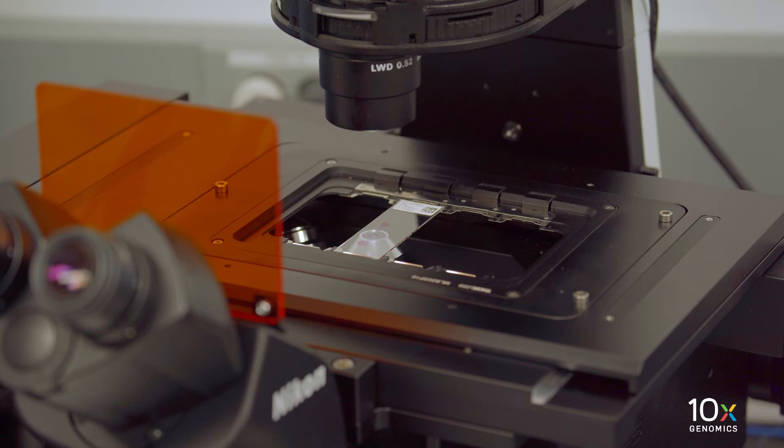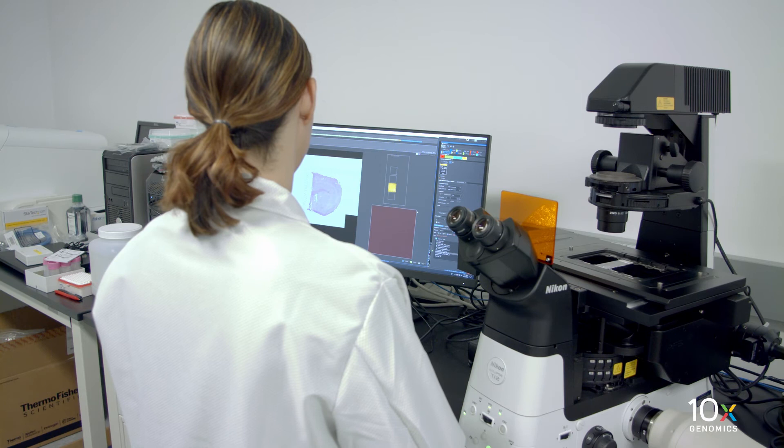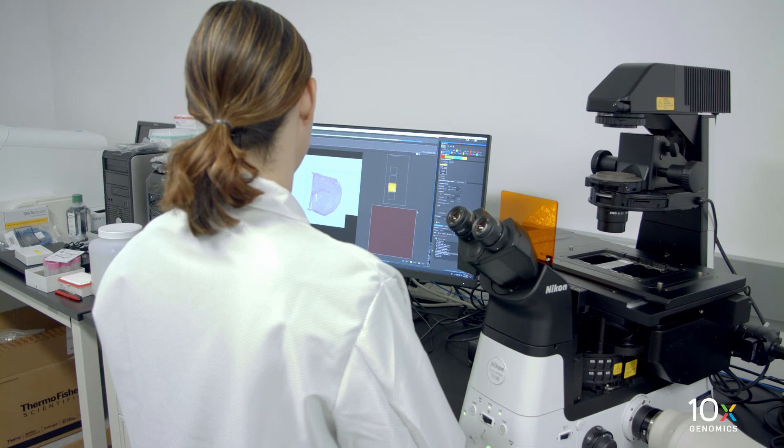Hit play to begin imaging. We will image all four capture areas individually at the desired magnification using brightfield imaging settings. One image will be acquired per capture area. Save the image as a TIFF, which is preferred, or a JPEG file.